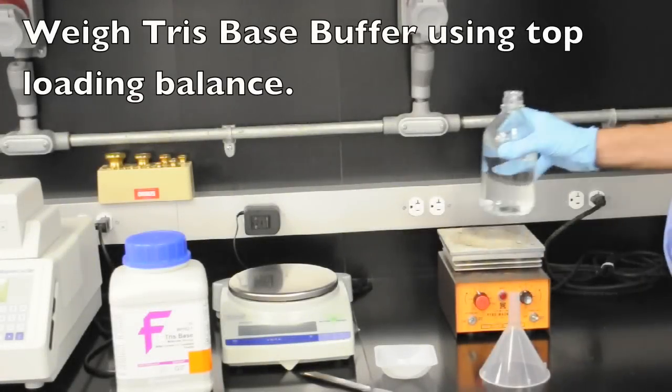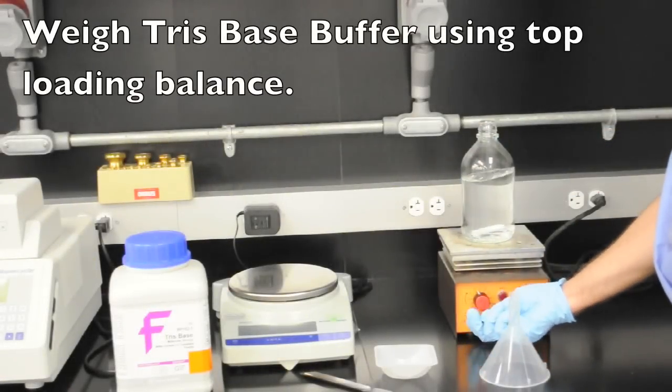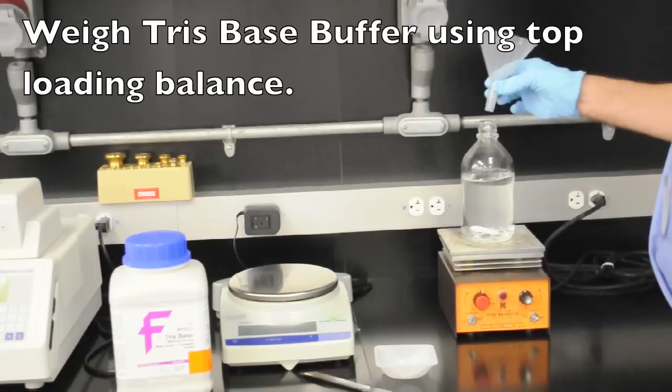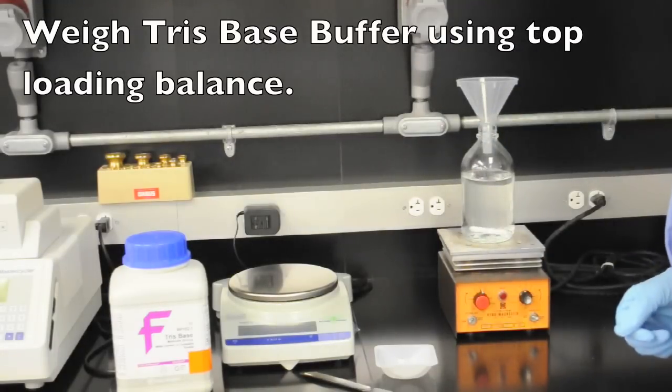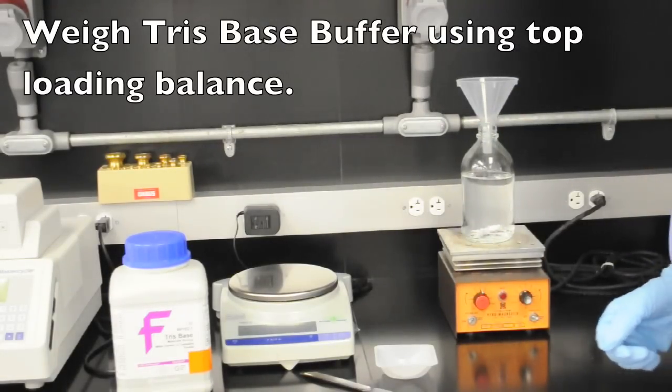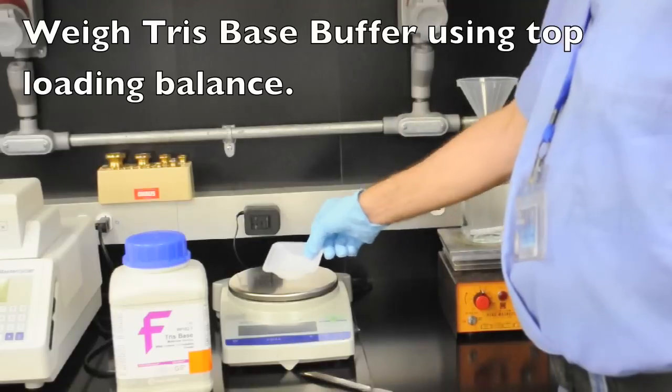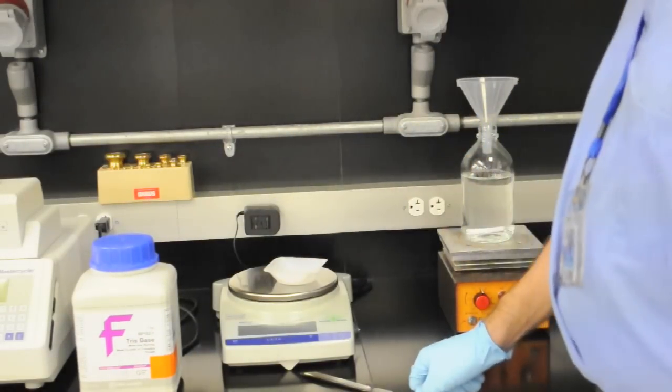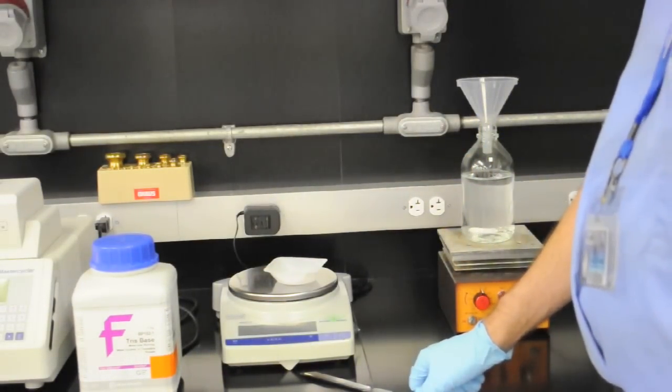Next we're going to weigh out the tris base. So first we place our reagent bottle, let the stir bar on the magnetic stirrer and get the liquid moving. There's a powder funnel that's put in place. The weighing boat is added to the balance and it's tared. We have to wait for the balance to stabilize on 0.00 before we can take our measurements.